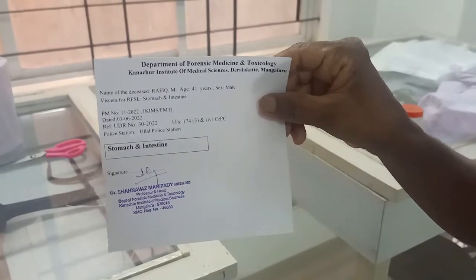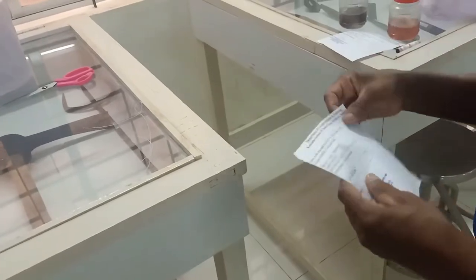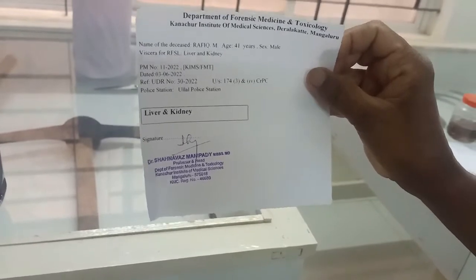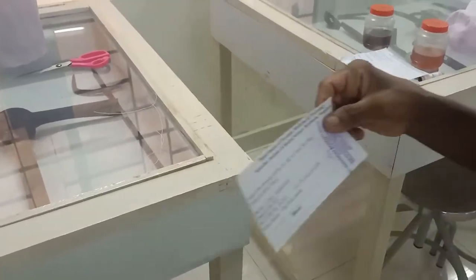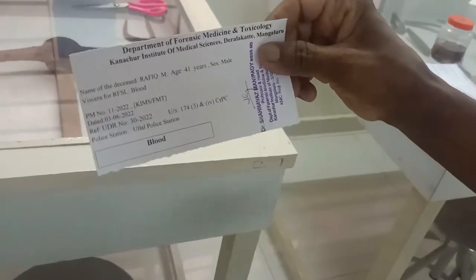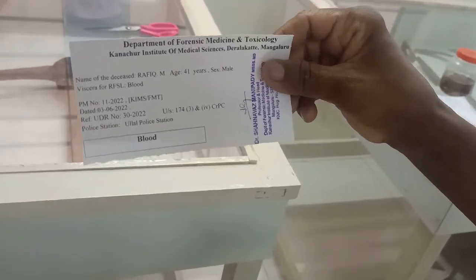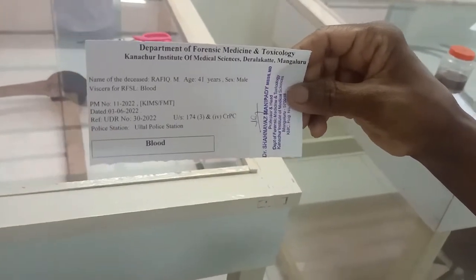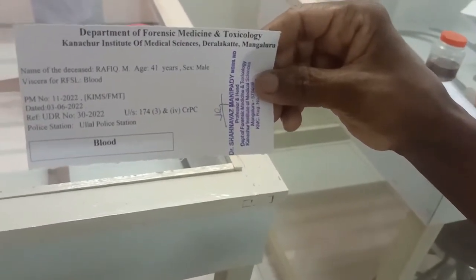This is the label for the stomach bottle containing the stomach and its contents and the intestine and its contents. This is the label for bottle number two, which contains one half of each kidney and 500 grams of liver with gallbladder. This is the label for the bottle which contains blood with potassium oxalate and sodium fluoride as preservative.